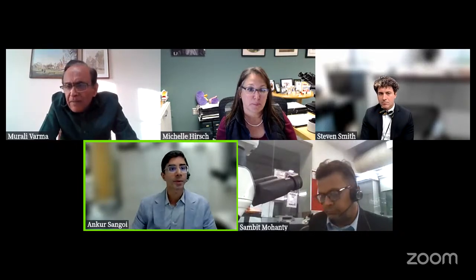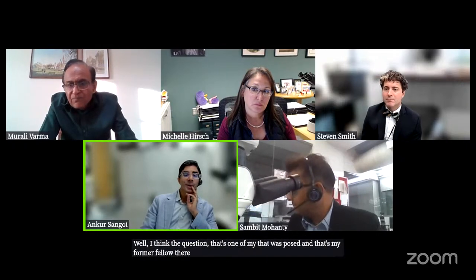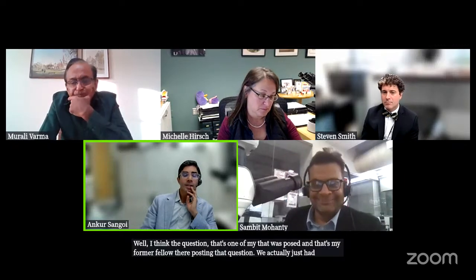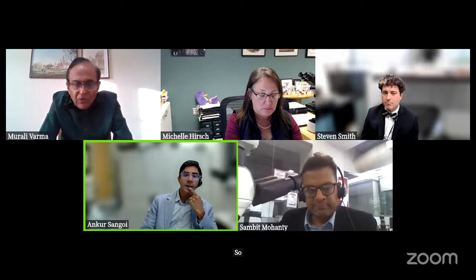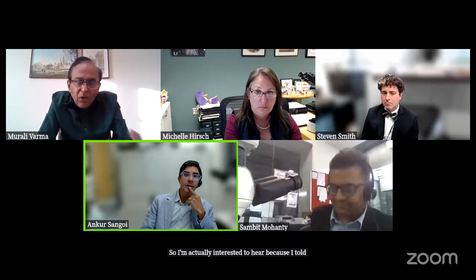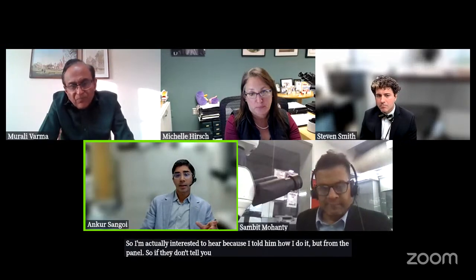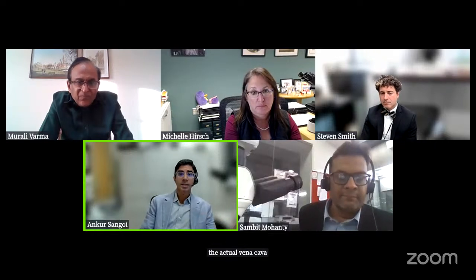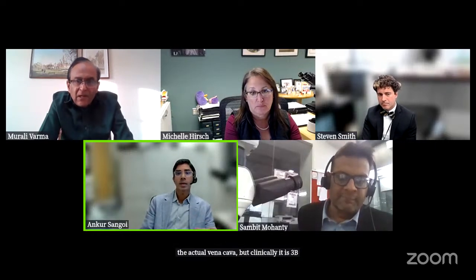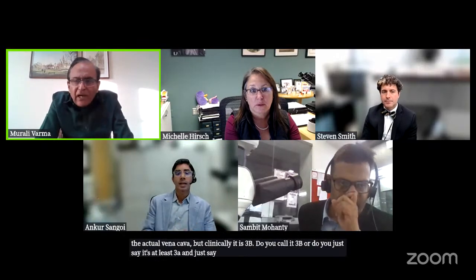Well, one of the questions was posed by my former fellow, and we actually just had this discussion a couple of weeks ago. It's not so much the 3A, it's the 3B. I'm interested to hear from the panel, because I told them how I do it. If they don't tell you it's a segment of the vein, the actual vena cava, but clinically it is 3B, do you call it 3B, or do you just say it's at least 3A and just say by report it's invading?